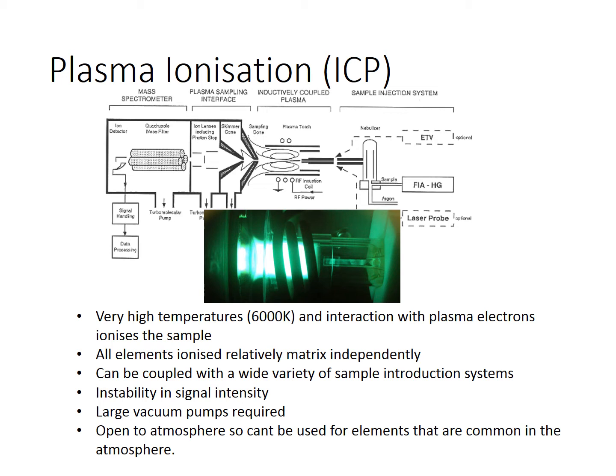It's really hot, and that's good because other types of mass spectrometer don't ionize all elements. Some elements are really, really hard to ionize. So for instance, thorium or thallium or tantalum, the T's mostly. They're really quite hard to knock an electron off. So if you wanted to measure two elements at the same time, one hard to ionise and one not, it would be very difficult. Whereas the plasma is so hot, everything gets ionised.